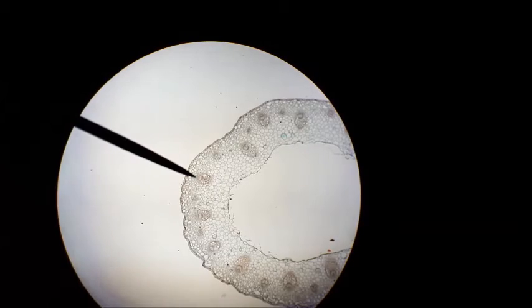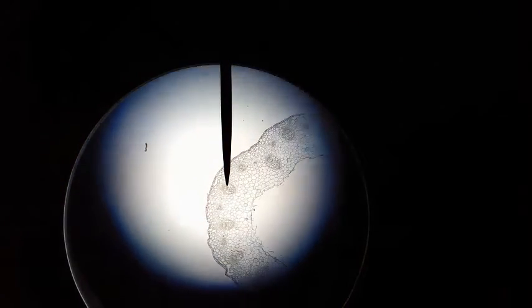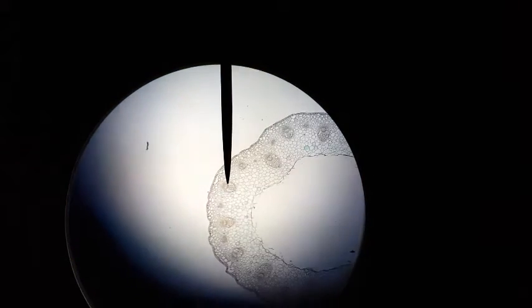The pointer is now on the fibrous cap over the phloem, which is called the sclerenchyma. I have now placed the pointer on the phloem of this dicot stem.